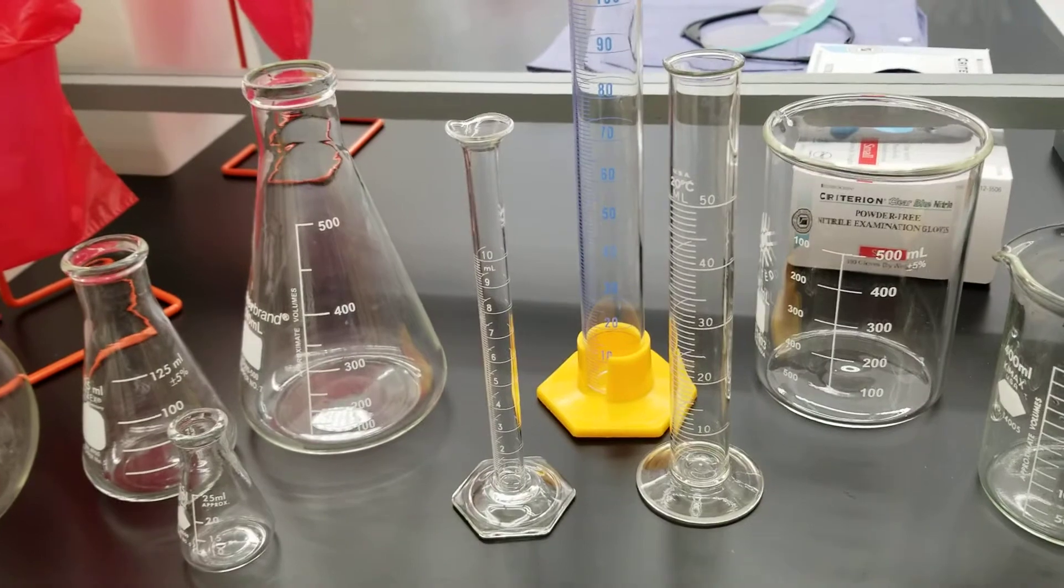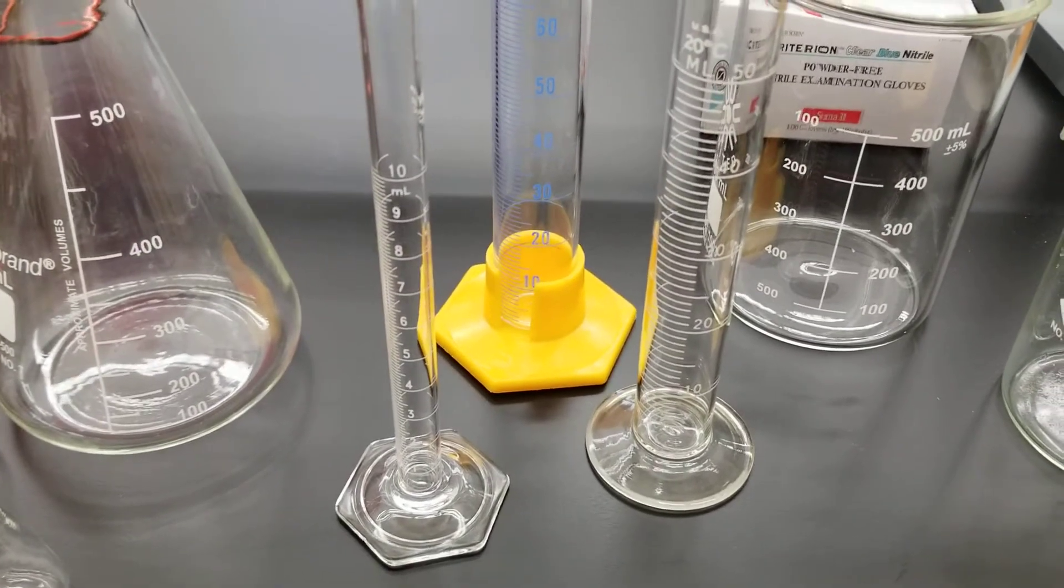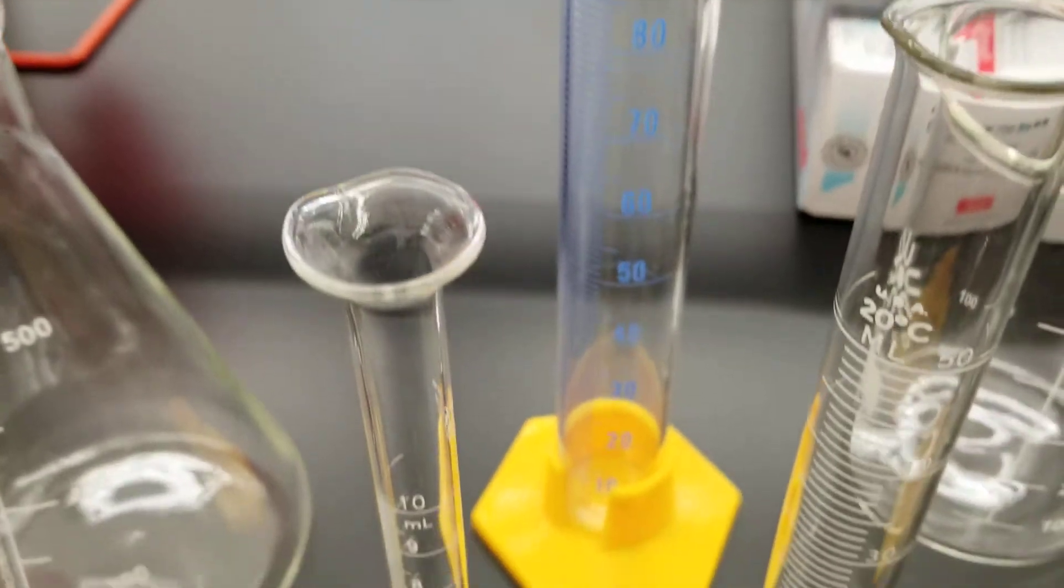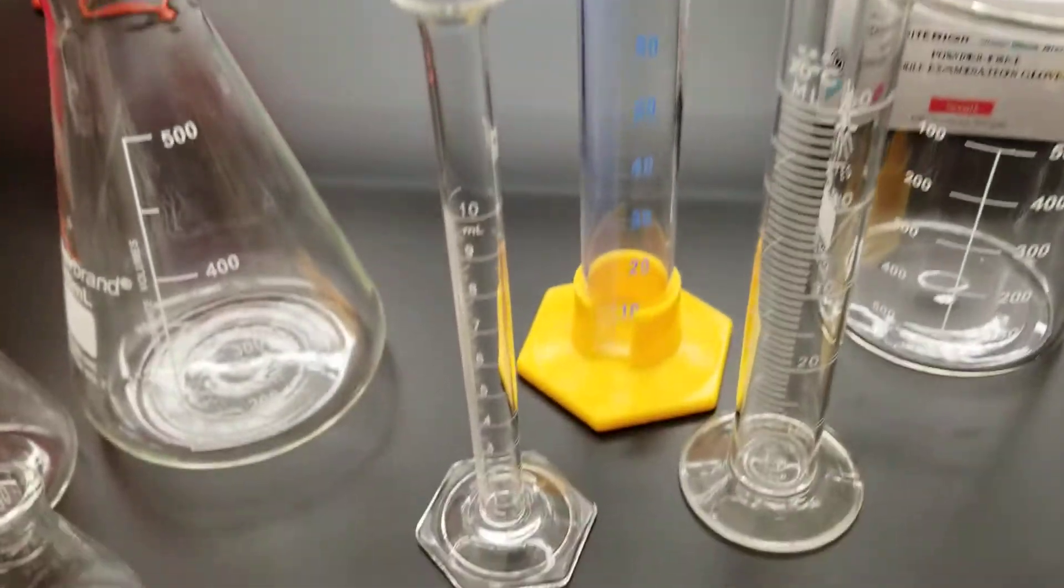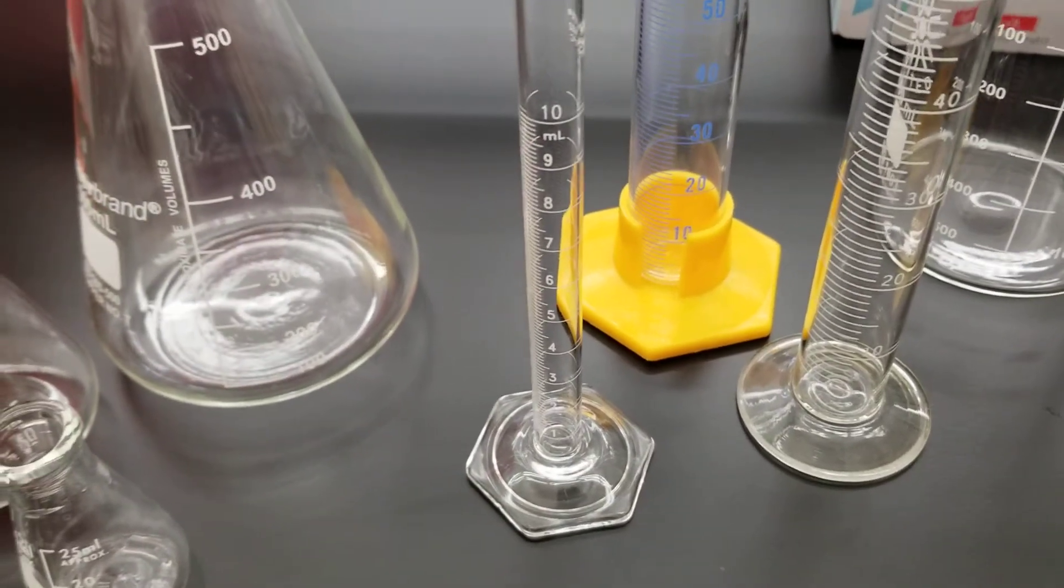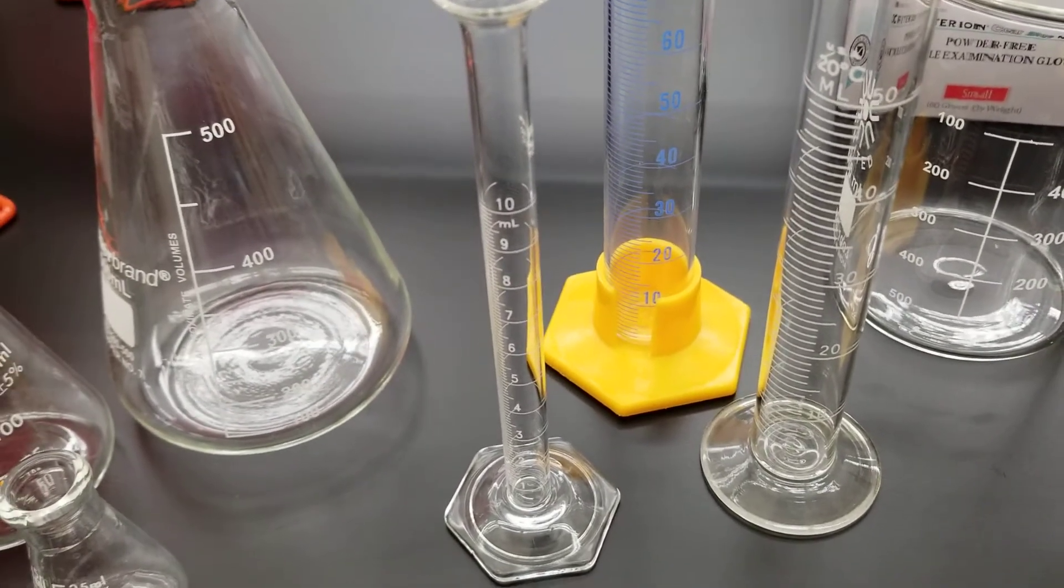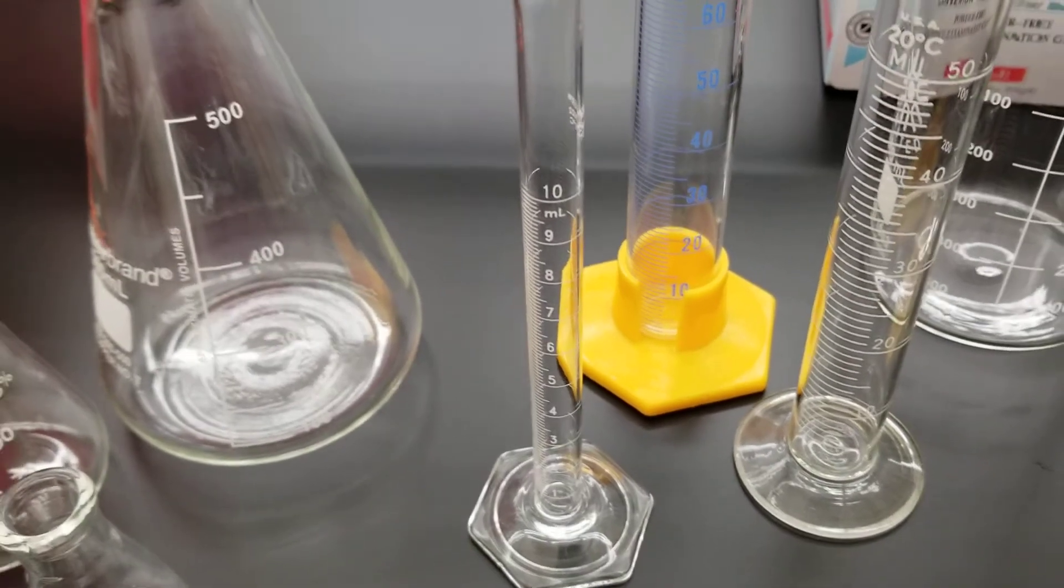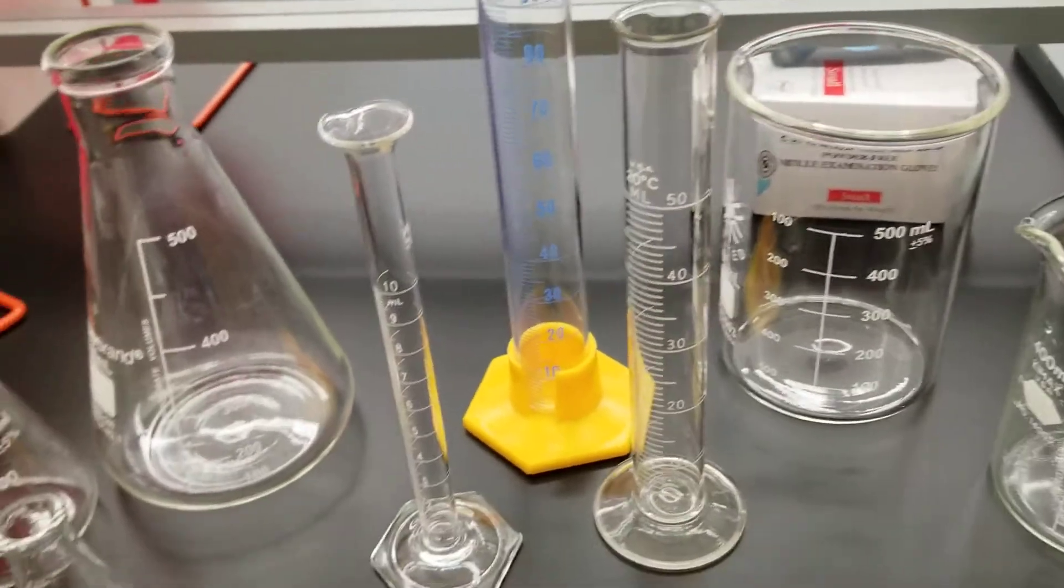So if I wanted to measure five milliliters of something, and I wanted to use a graduated cylinder, should I use this guy in the back where it's 100 milliliters and the five would be right down here at that middle? Is that a good idea, or should I go to the smaller one that only goes up to 10? And the answer to that question is you'd use the smaller one. So you want to go to a type of glassware that ends up having more accuracy if and only if it is closer to that volume or the range of volume that you're looking in. So using a large one to measure a small amount would not provide as much accuracy.